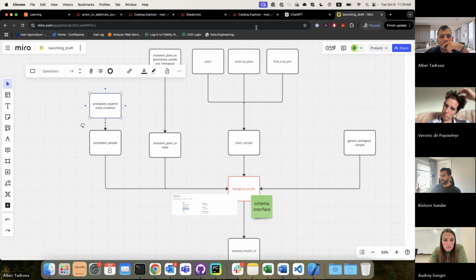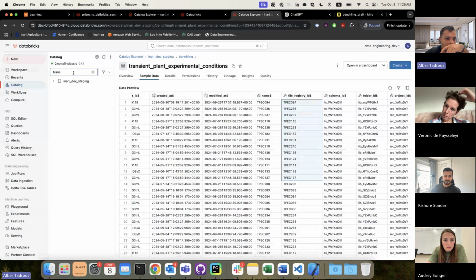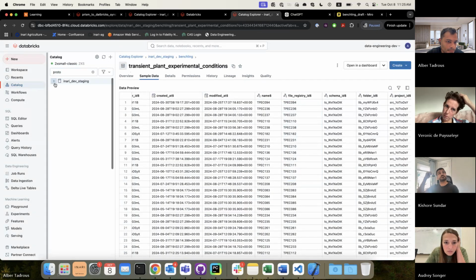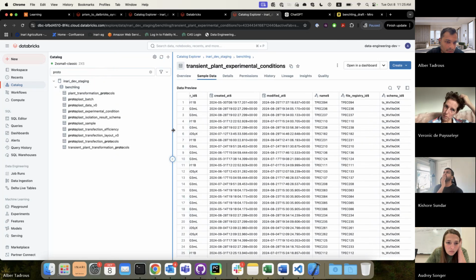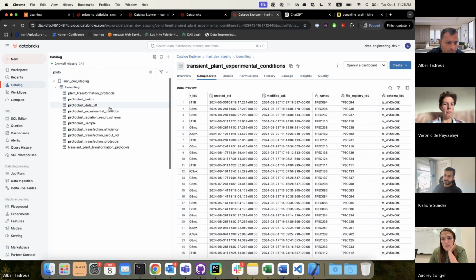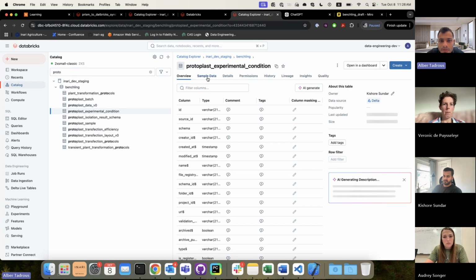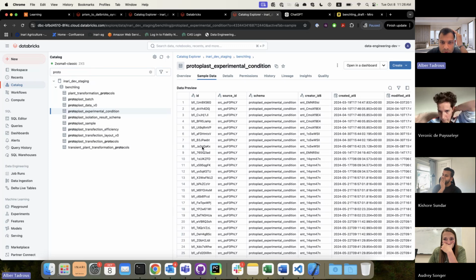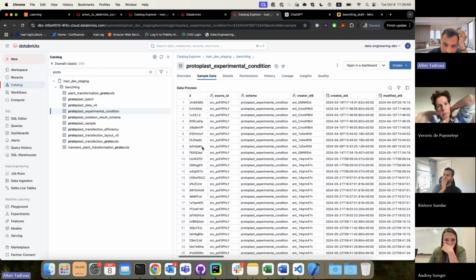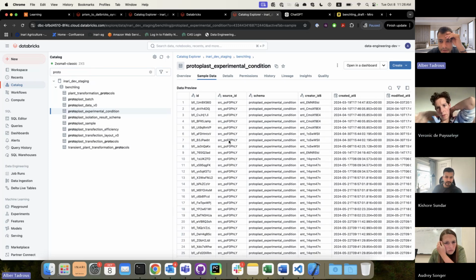Okay. Okay, so let's take a look at this protoplast. What is the important information we need to capture here?